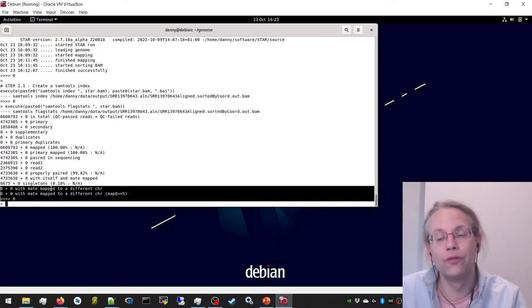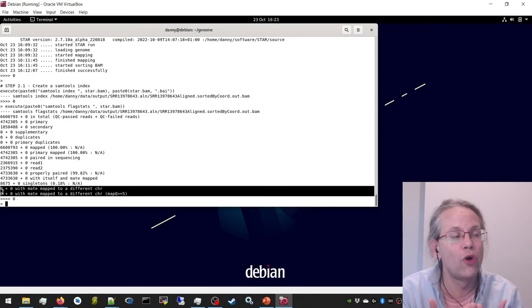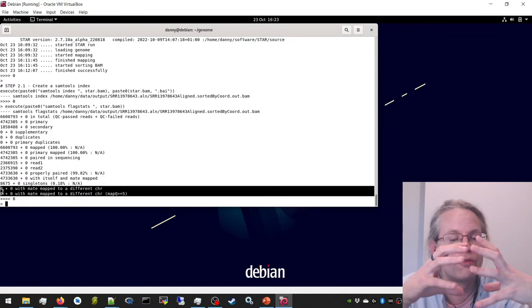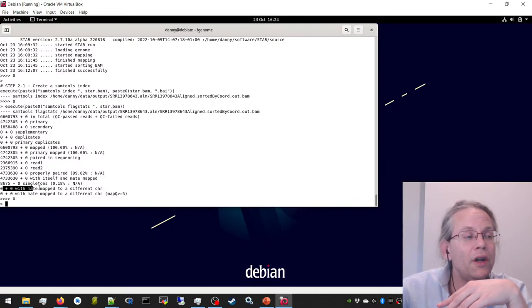If you actually do, for example, Hi-C, you do expect to see numbers here, because when you do Hi-C, you are doing DNA sequencing after you kind of physically merge the DNA together, right? In Hi-C, what you're doing is you're fusing chromosomal regions which are physically close. So if you see paired end reads with one of the reads on chromosome 1, one of the reads on chromosome 3, for RNA-Seq, you would say that this is wrong. But for paired end reads, you can do this. It can happen when you do things like Hi-C or different types of sequencing.